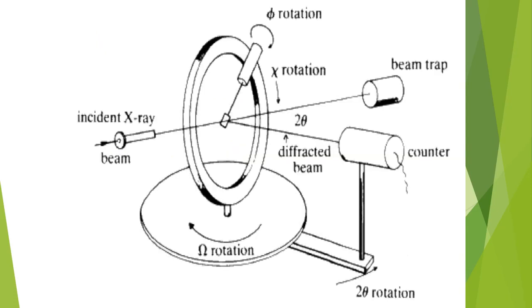Here is the pictorial diagrammatic display of the single crystal X-ray diffraction technique, in which different kinds of rotations are shown and four circles are observed.